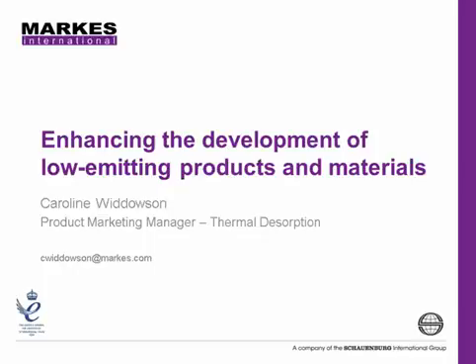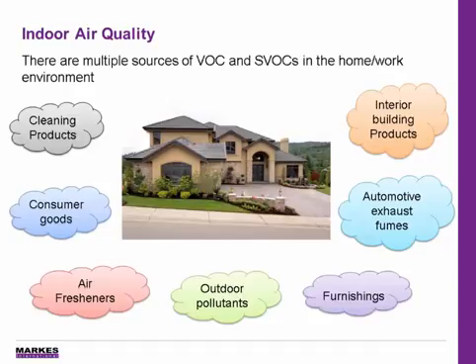Caroline, over to you. Thank you, Richard. Today we're going to talk about how we can utilize microchambers and thermal desorption GC-MS to produce low-emitting products and materials.